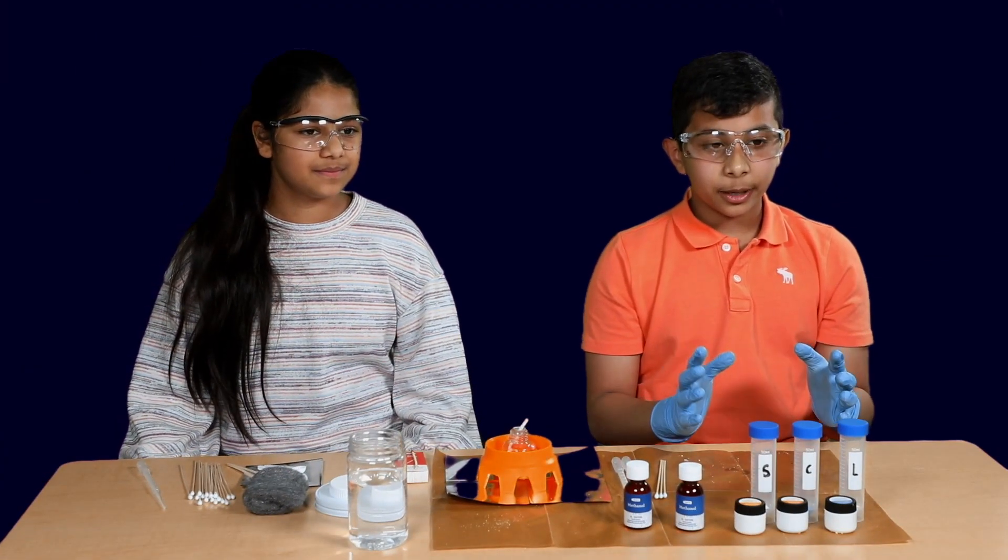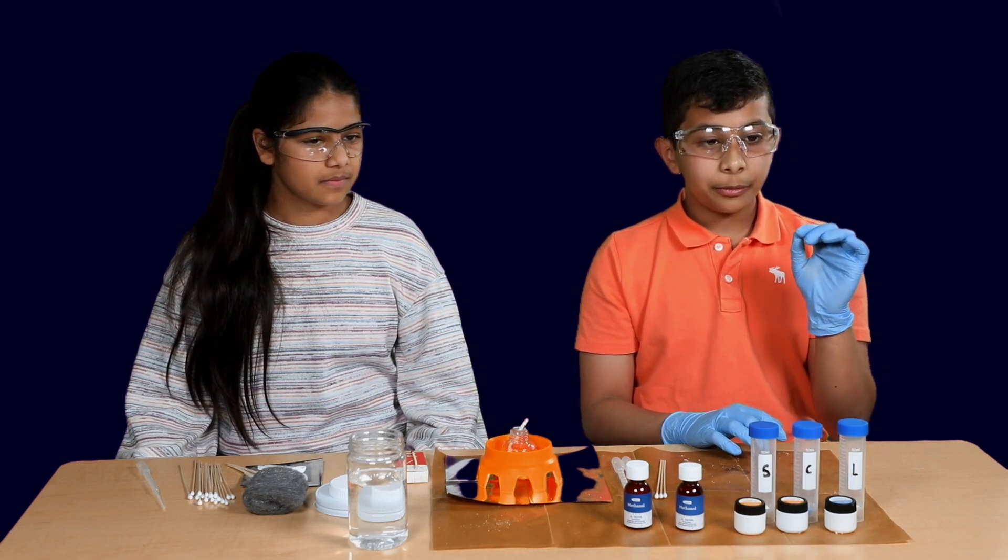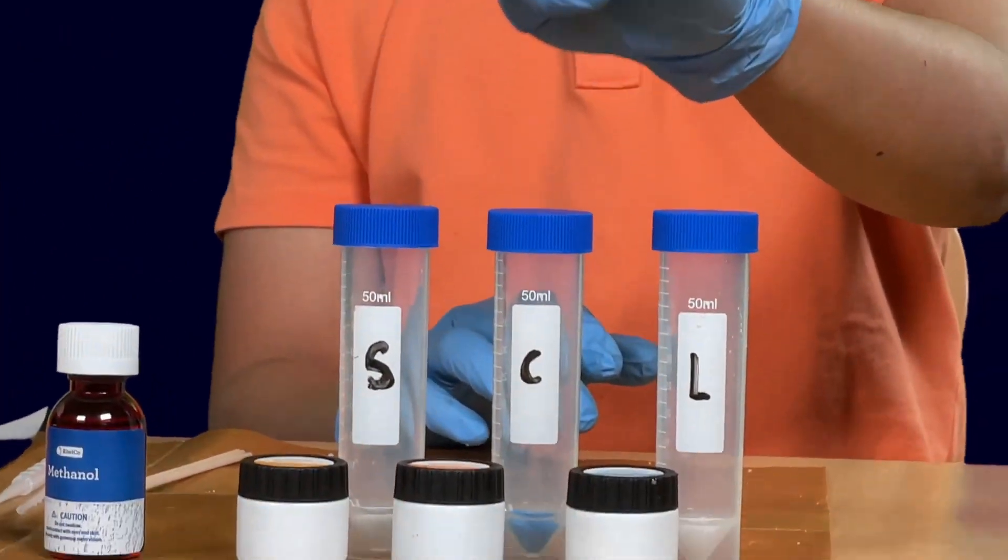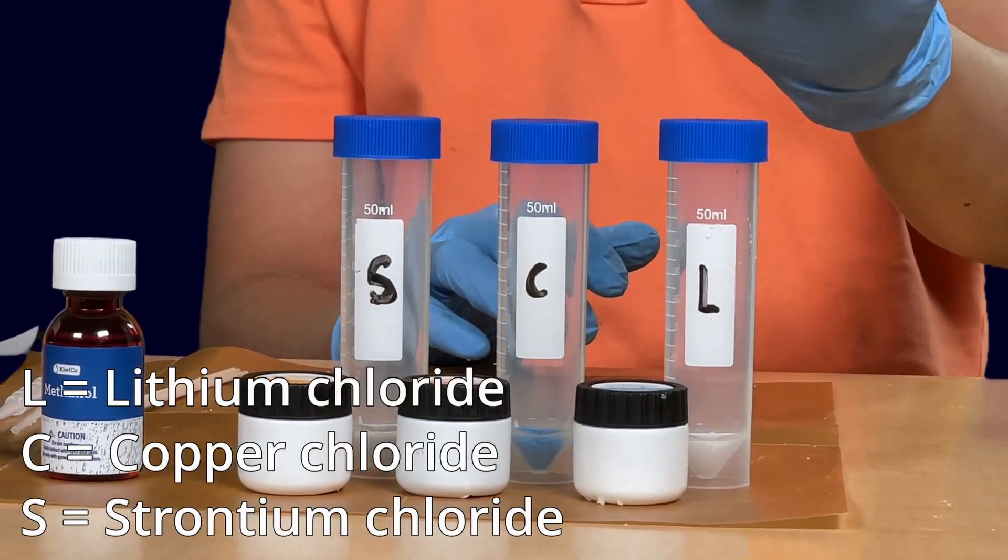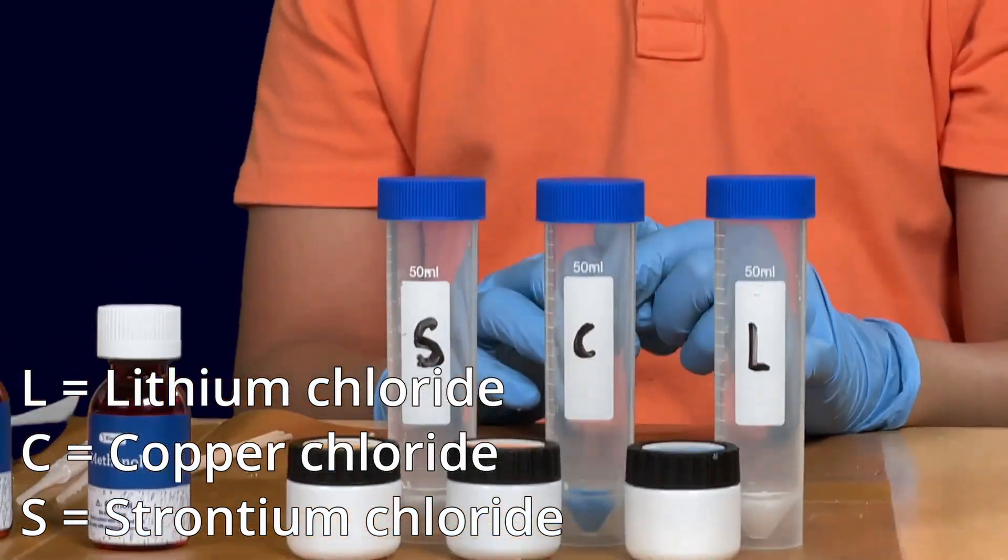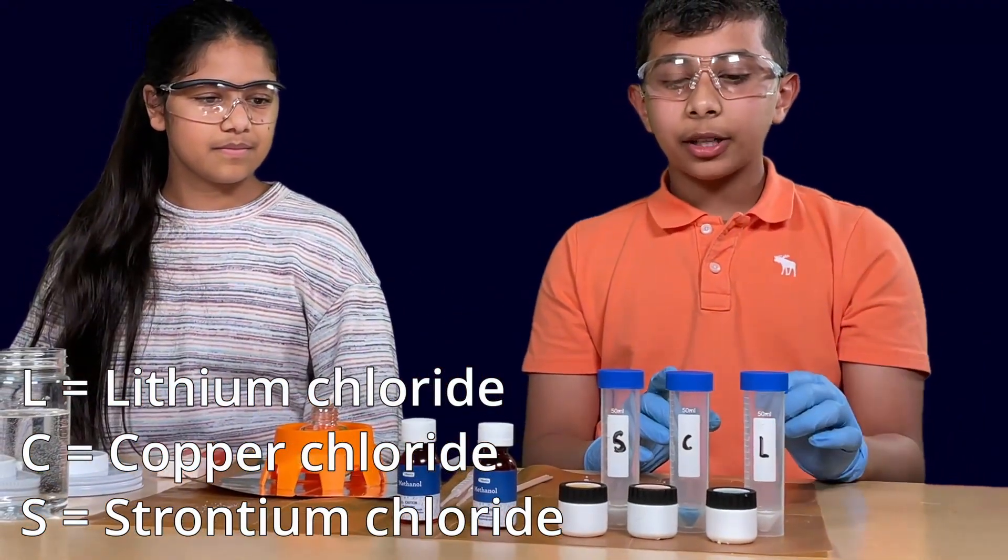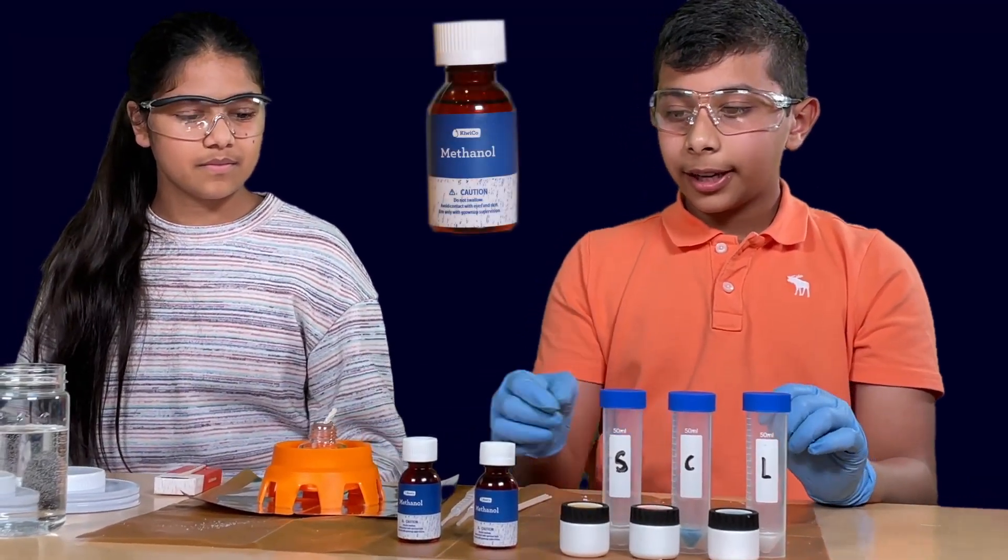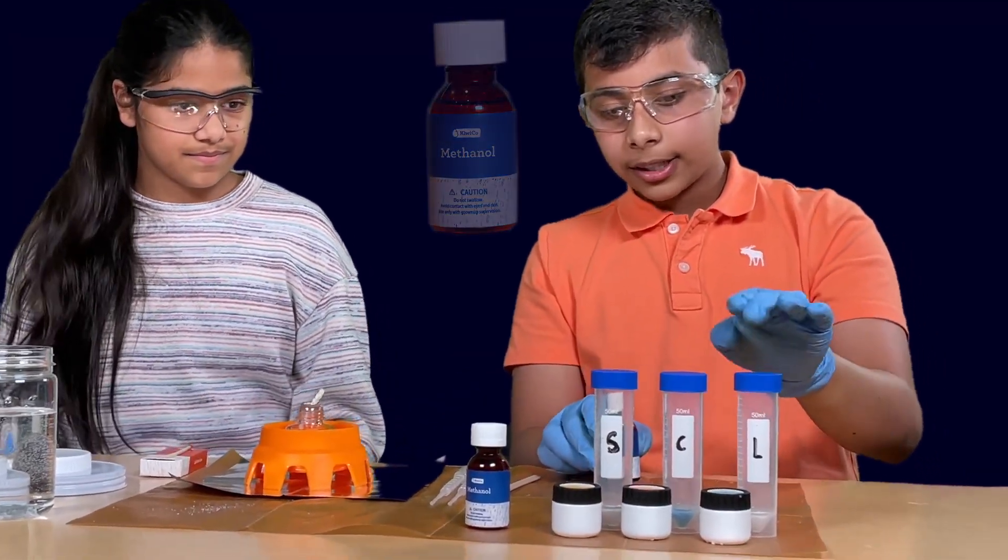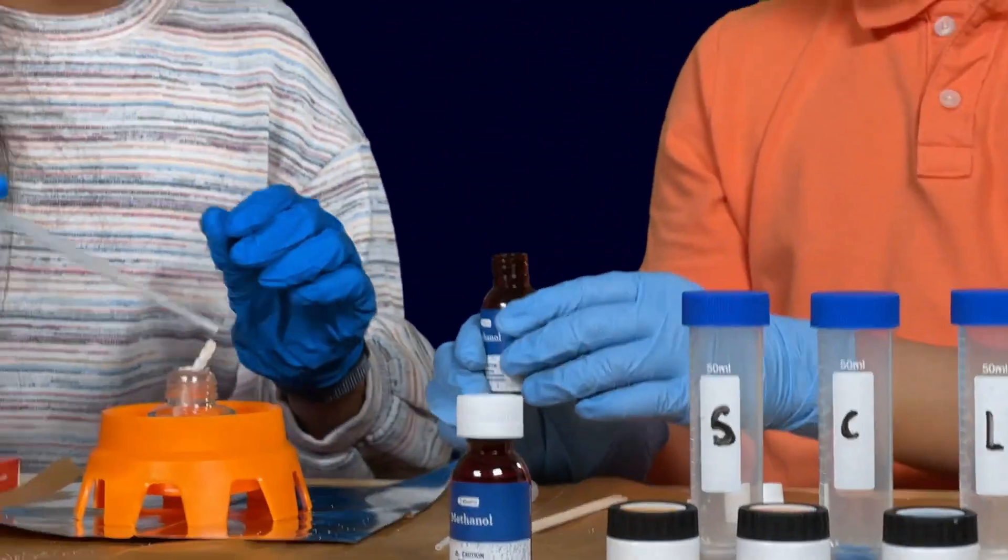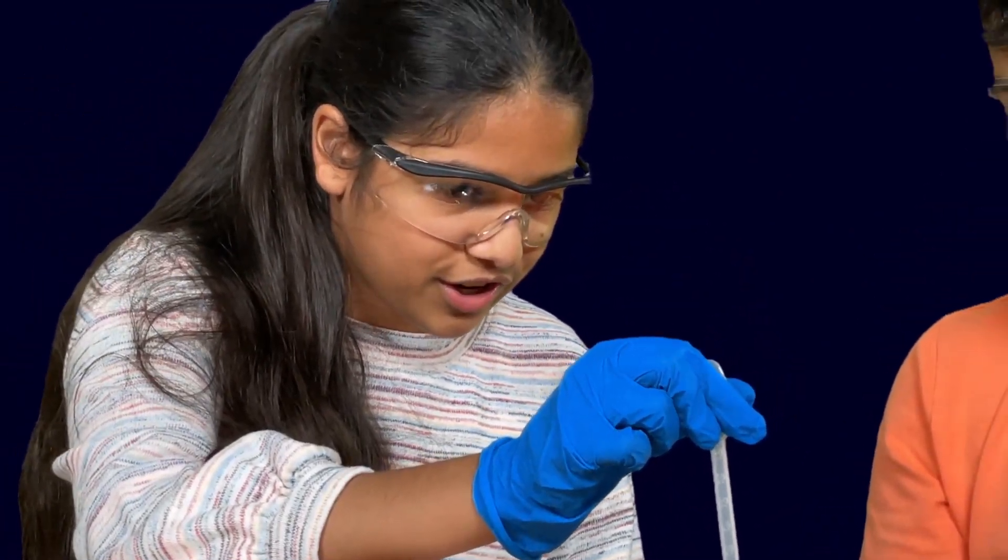Yeah, that was an interesting find. So for this experiment, we first got three test tubes, one labeled L, C, and S. L for lithium chloride, C for copper chloride, and S for strontium chloride. And then we put each of the corresponding chemicals inside the tubes. Then, we're going to get some methanol and put 10 milliliters in each tube. So, well, let's start with that. Sonvi, would you like to do that? Sure.